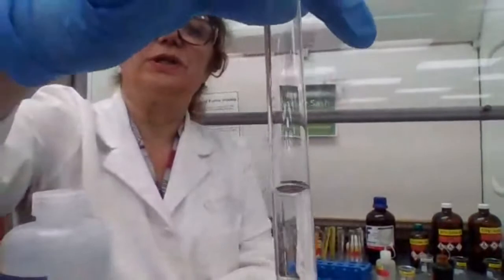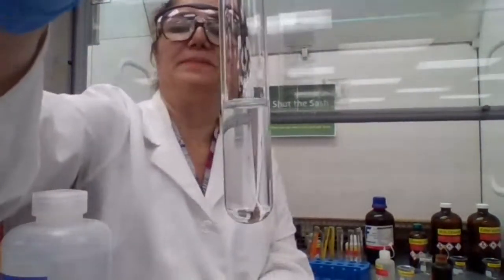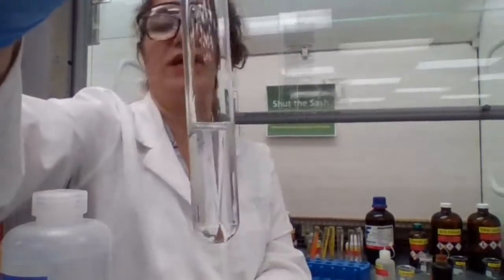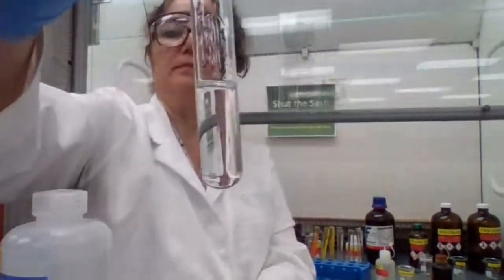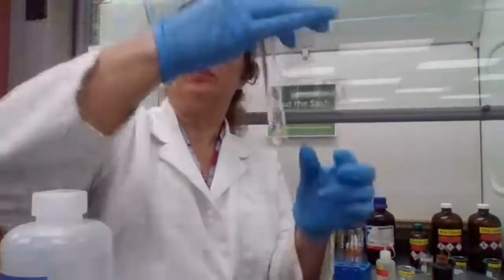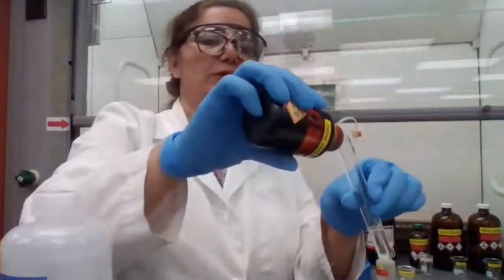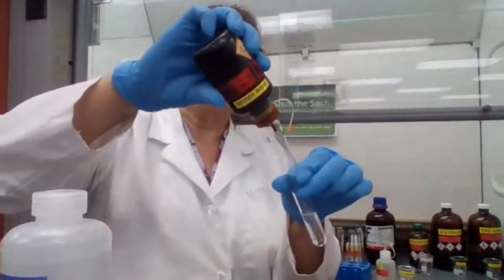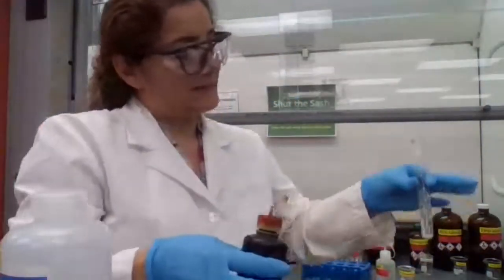With the iodine solution, no precipitate has formed yet. What should I do? I need to add more of the iodine solution until the color stays there. It has to be yellow color before I let it stand.